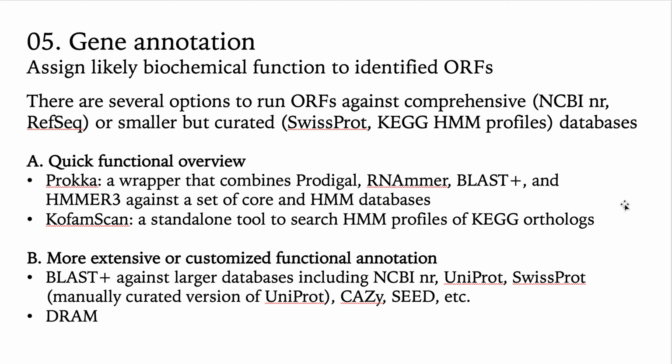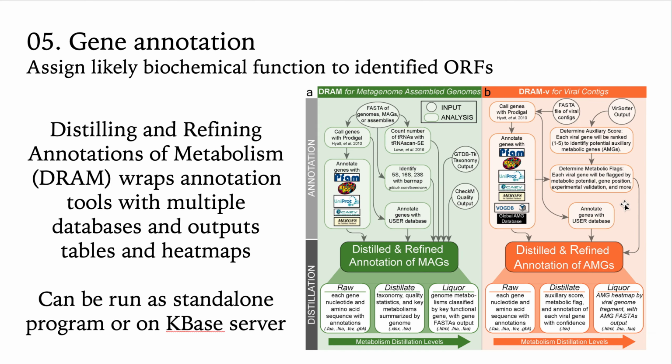And you can run those against NCBI, which will be the biggest and most extensive database. UniProt, also very large. Swiss-Prot is the manually curated version of UniProt, so you'll have higher confidence in your annotations, but they won't be as extensive. CAZy is for carbohydrate related enzymes, and there are several others that you could look into. And finally, I want to mention a fairly new program called DRAM.